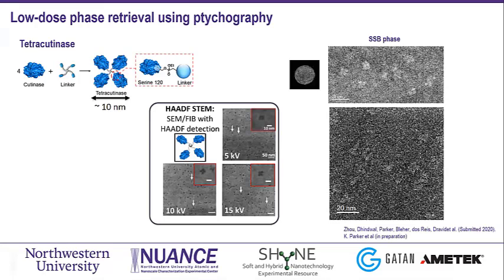So meaning that was basically a pure sample at room temperature. So this is really exciting, and it shows a great potential using 4D STEM and ptychography in this case for biological materials here.